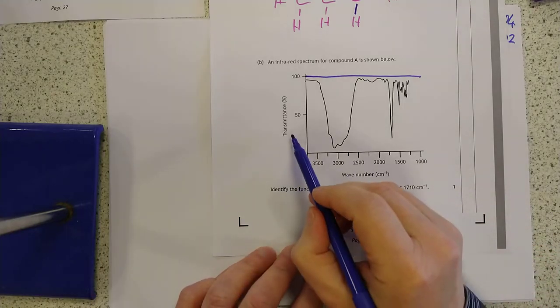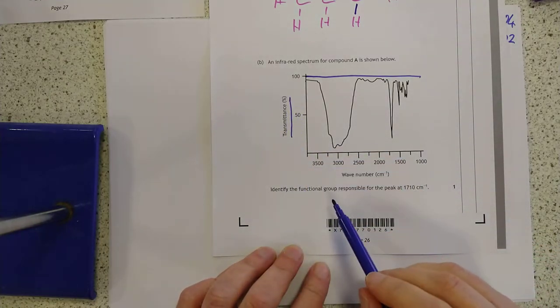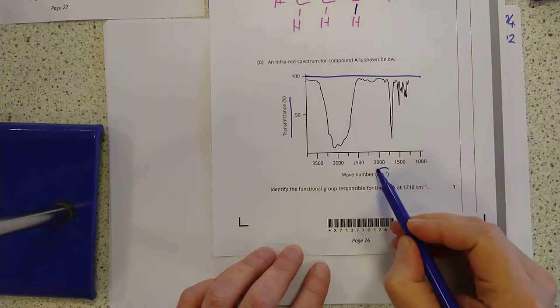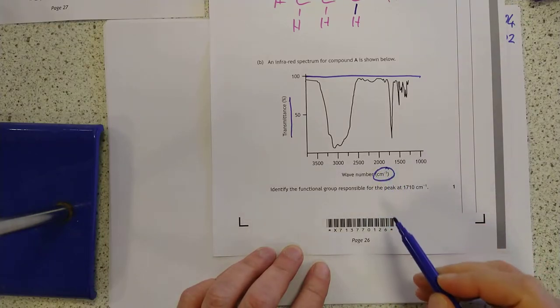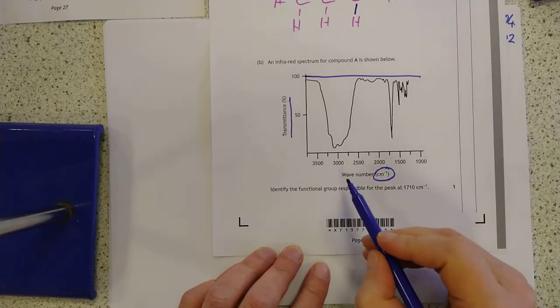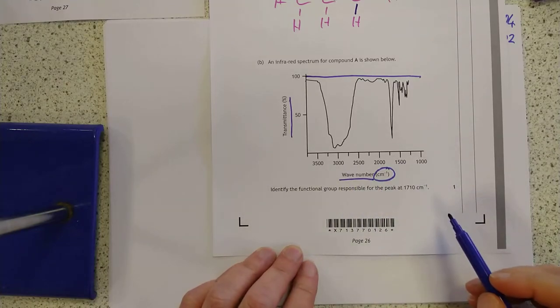If you have a look at here, you'll find transmittance up the side. And this, what sort of unit is that? A wave number as well, because I called it wavelength earlier on.